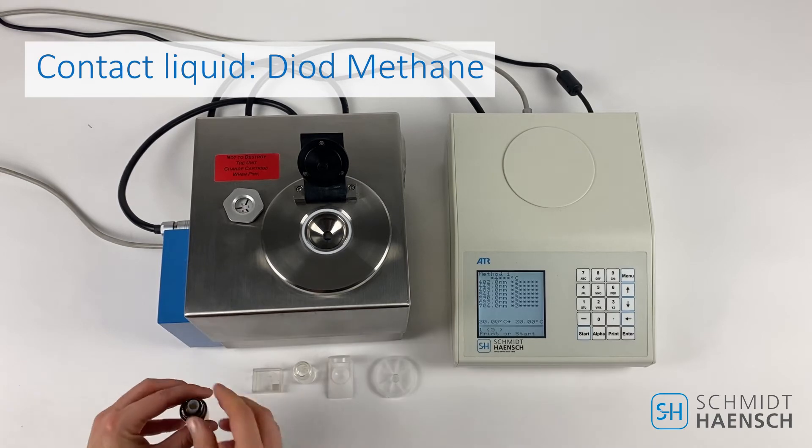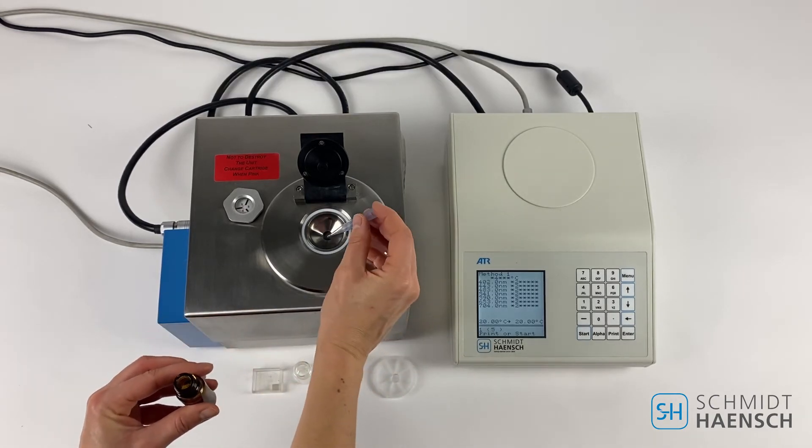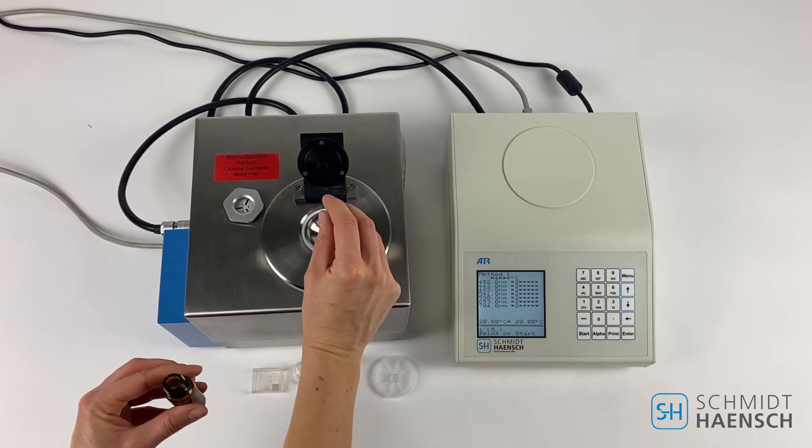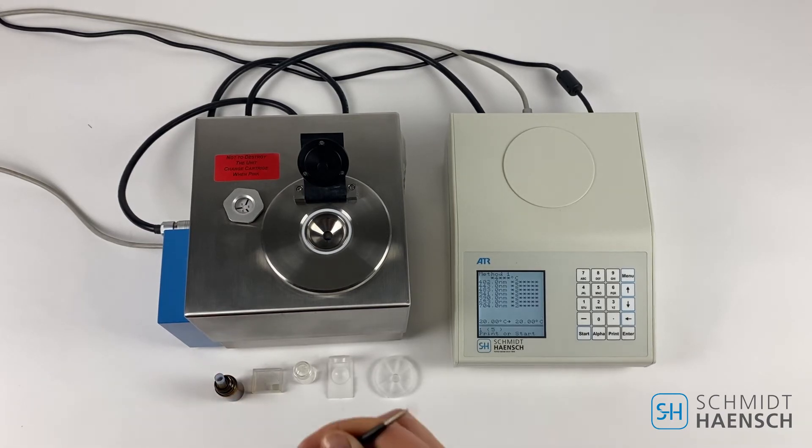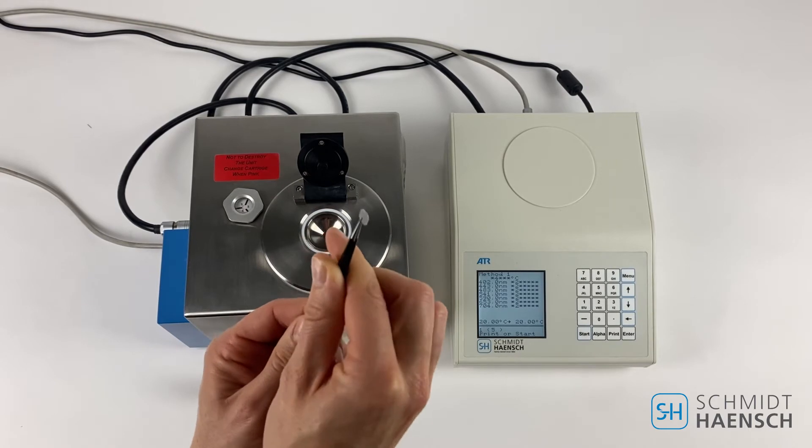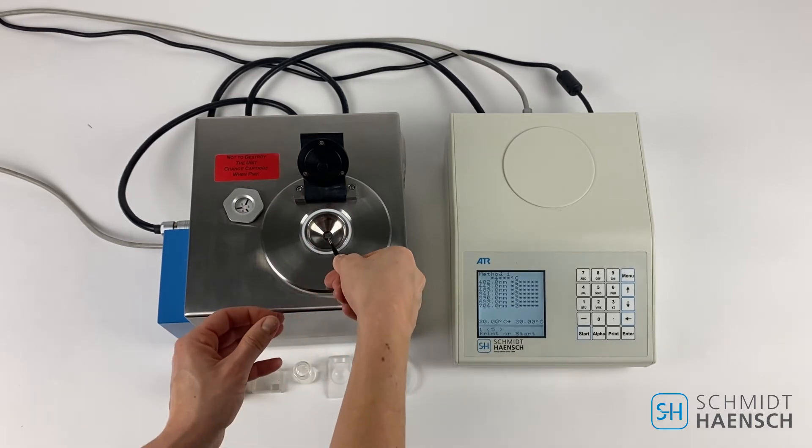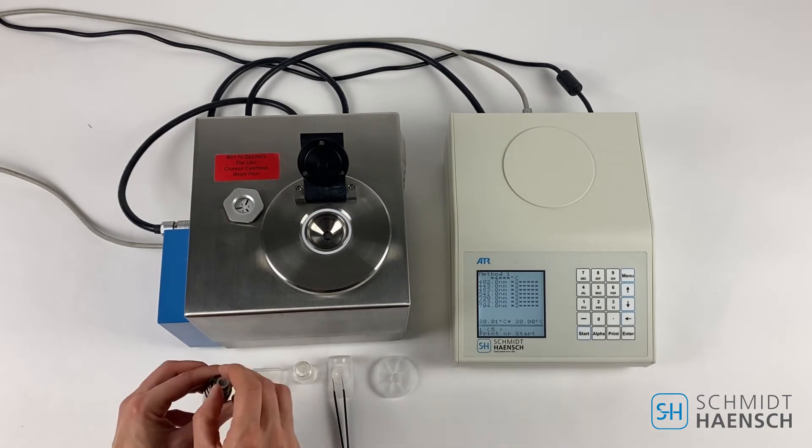We will demonstrate how to measure a thin polymer foil sample. We will use a contact agent, one single drop onto the prism surface. We have the thin polymer foil sample, a cut piece that we will put on top of the prism surface.